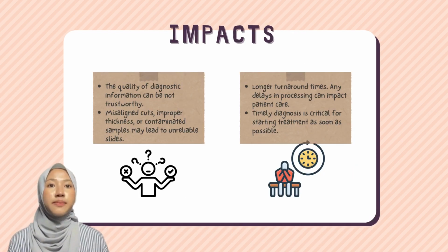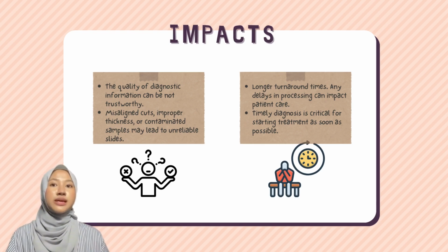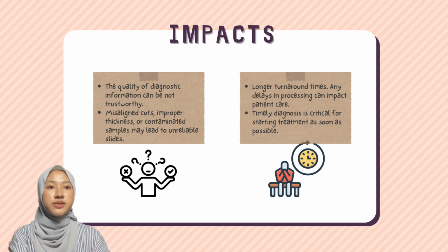So, what's the impact of this conventional method on diagnostic outcomes? When samples are mishandled or not processed correctly, the quality of the diagnostic information can suffer. Misaligned cuts, improper thickness, or contaminated samples may lead to unreliable results, risking a misdiagnosis or an inconclusive report. All these factors combine to contribute to longer turnaround time.